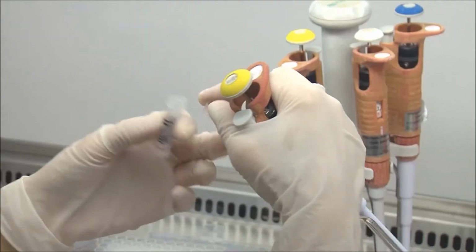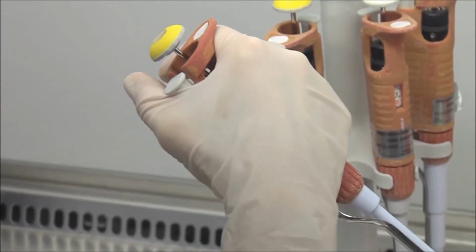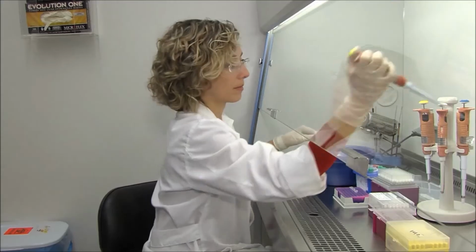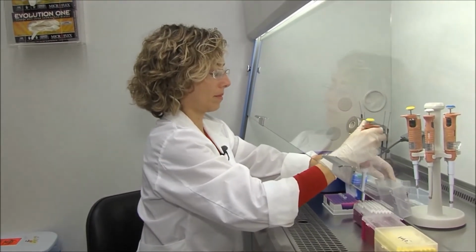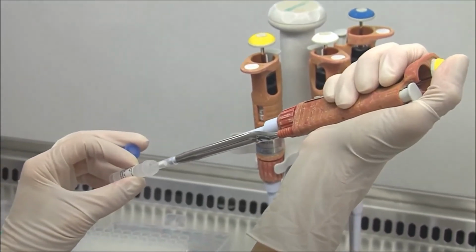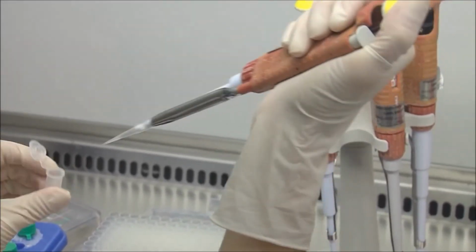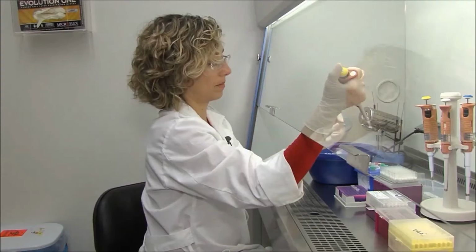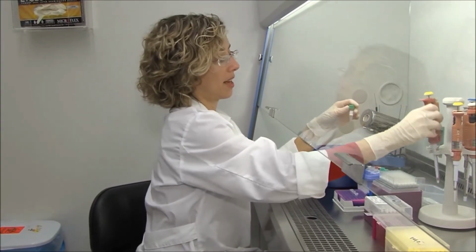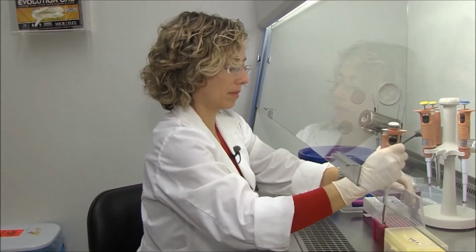This is the other primer. Primer ngược. And these are the dNTPs. dNTP. Now the last reagent that we have left is the Taq polymerase. Cuối cùng là chúng ta sẽ hút enzyme.